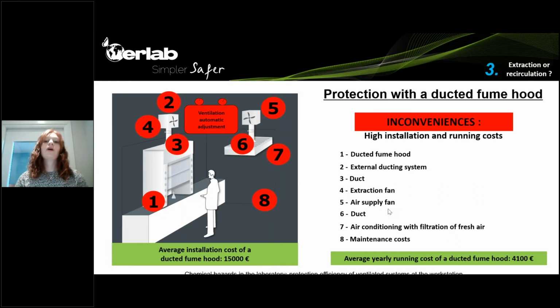You also have yearly running costs that are mainly composed of the energy consumption and the energy cost, of course. So as we were saying previously, they depend on the building, on the fume hood, the age of the fume hood. But as we said previously, they can be between 2,000 and 4,000 euros per year.